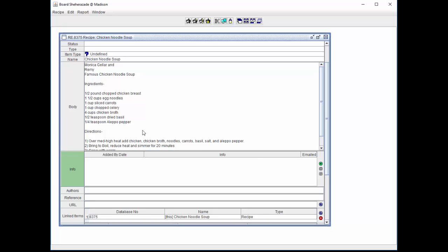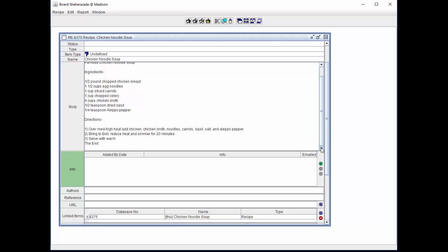If the information entered into the body field is larger than the available space, a scroll bar will appear on the right side of the field. And the user can scroll down to access the information or add additional information.